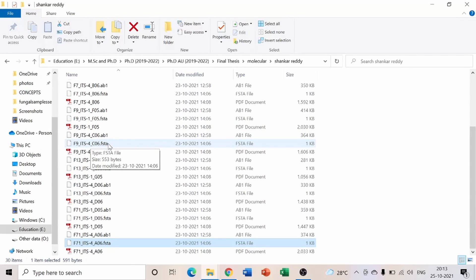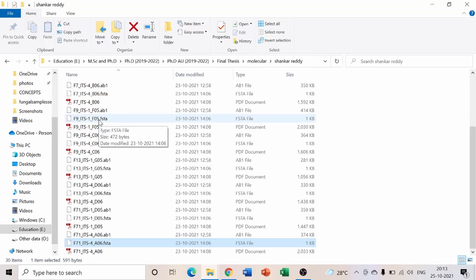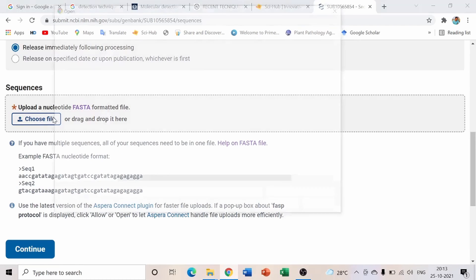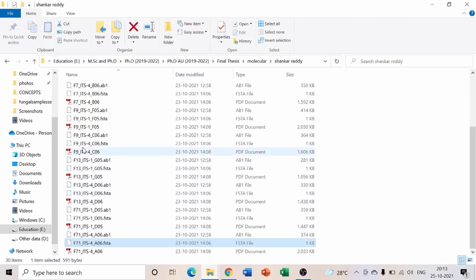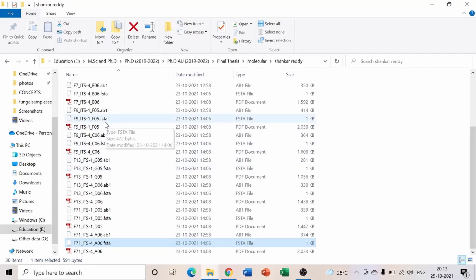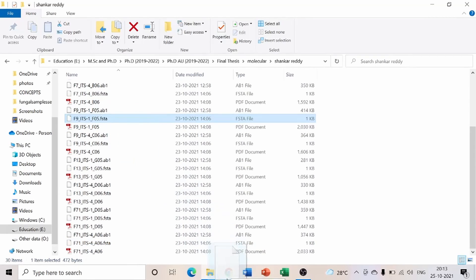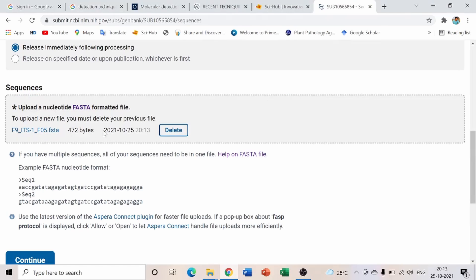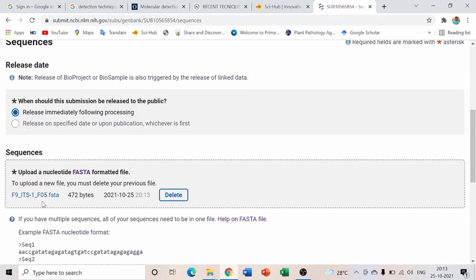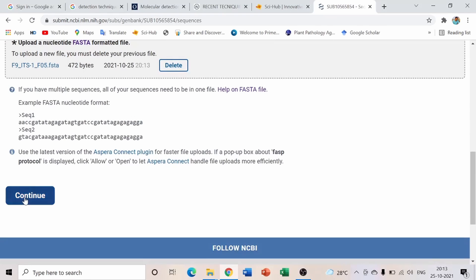You can choose to upload one or multiple FASTA format files. You can use 'Choose File' or simply drag and drop the file — dragging is easier than navigating to the folder repeatedly. I am dragging the FASTA format ITS1 file for isolate 9. Once uploaded, it shows a blue confirmation with a delete option. Click Continue.